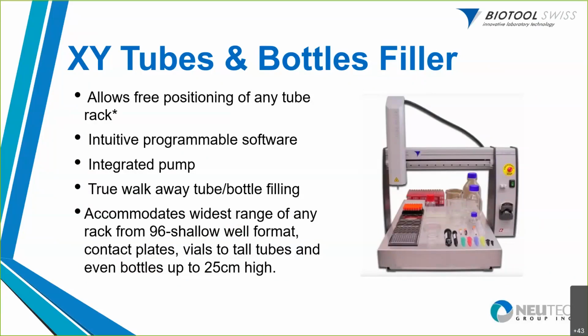And so this system allows for the free positioning of any rack and any tube or any kind of container. It's a fairly intuitive program to program it to where those things are located. You basically use an interface to describe to it where things are located and how many, and then it automatically goes and finds them. You tell it how much to dose or how much to put in, and it puts in that same amount every time. So you eliminate any kinds of mistakes.